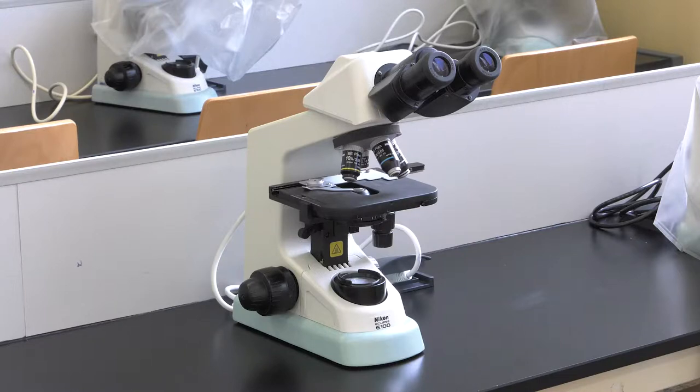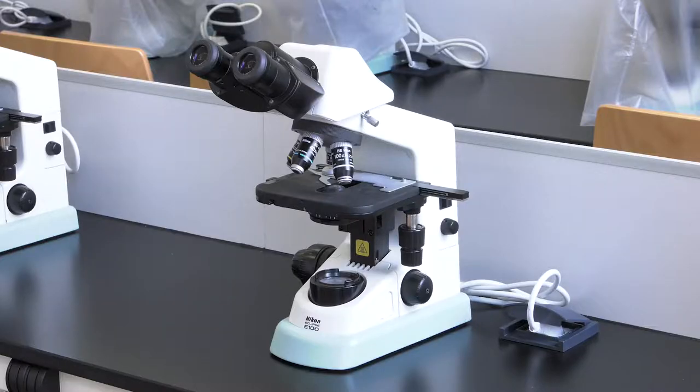We can identify three types of components in a microscope: light source, lenses, and structural and mechanical items.